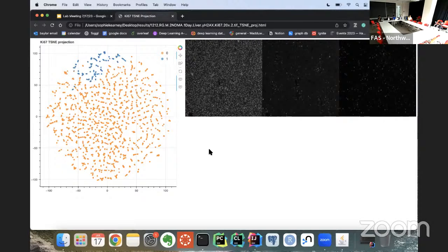You can do this on the bacteria data. Ramit, you have the whole bacteria data set, right? And you've already put in some of the t-SNE and UMAP type things.